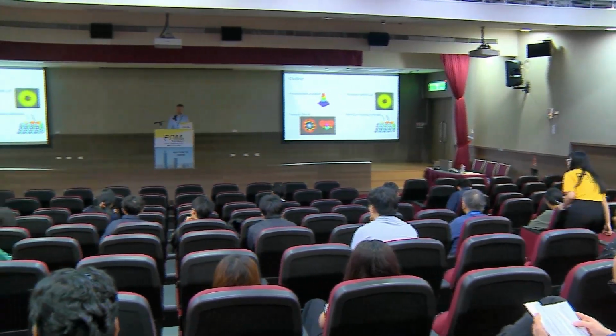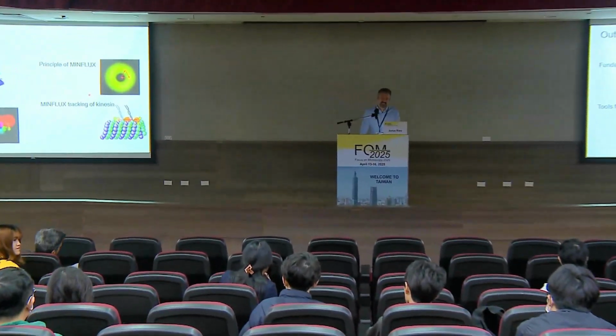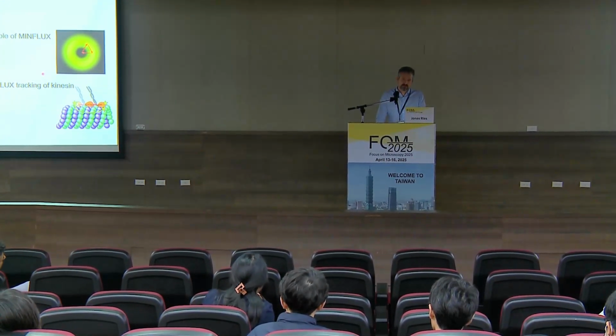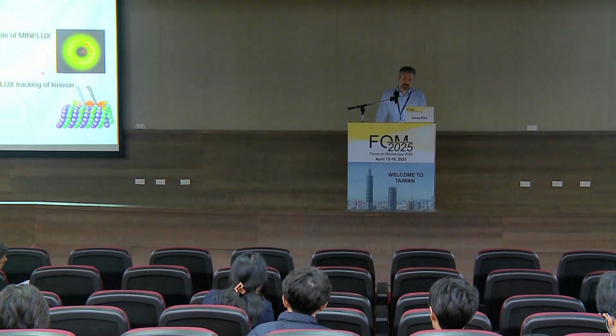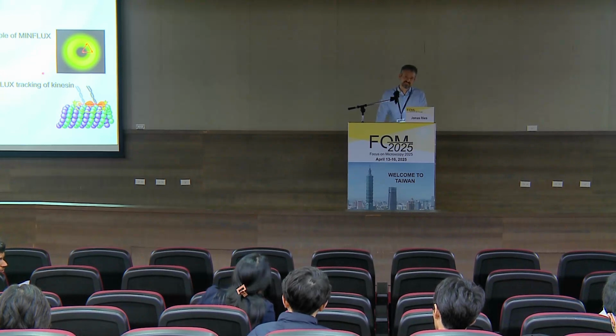Thank you for the great talk. I have several questions. First, I work a lot on membrane receptors on the plasma membrane, and you just mentioned that the control for the quality of single molecule localization microscopy is very important, especially, I think, in the DNA-PAINT case, because we use transient binding, and the imaging strand is also binding unspecifically to, especially, I think, lipids on the plasma membrane.